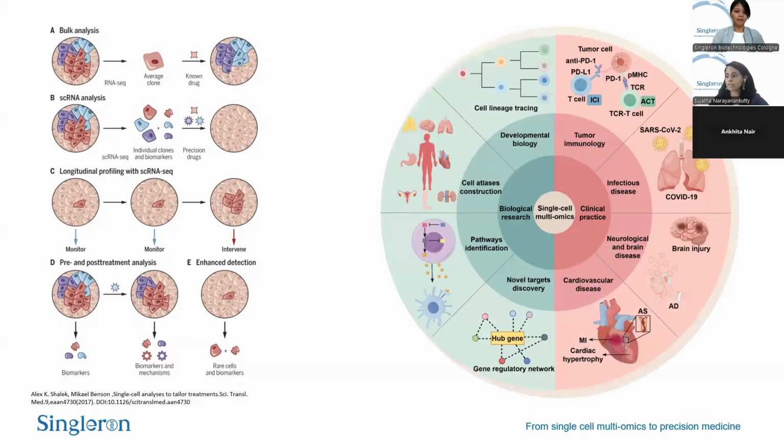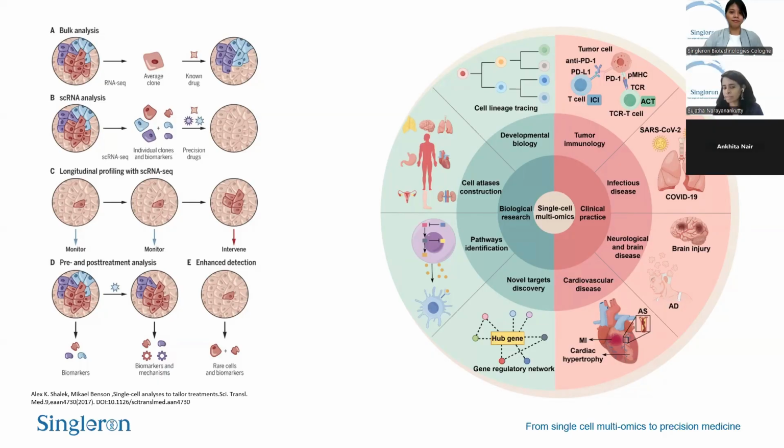Overall, clinical applications can be in the research space, where you're using clinical samples to develop tissue or disease atlases, identify pathways, develop drugs, understand biomarkers, and study developmental biology. It can then move slowly into clinical practice, where you're treating tumors, infectious diseases, diseases of tissues, and so on. So single-cell applications straddle both, and can be in any of these fields or at the junction of them.